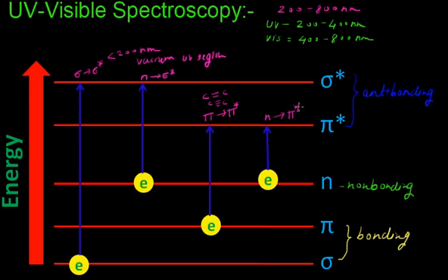Such compounds show the electronic excitation non-bonding to pi star.